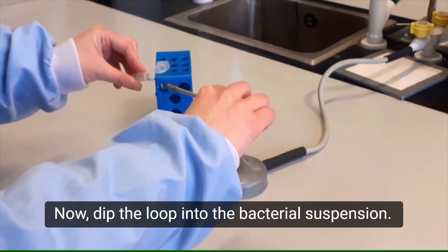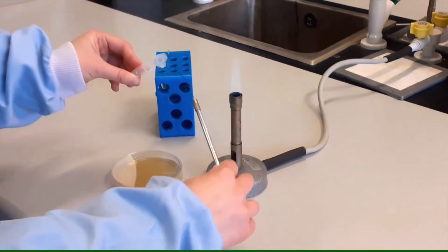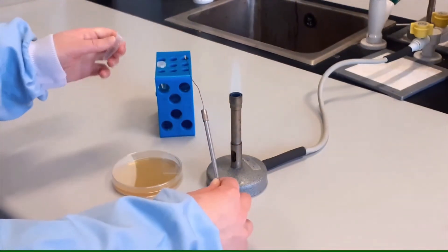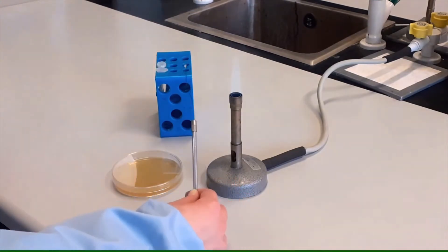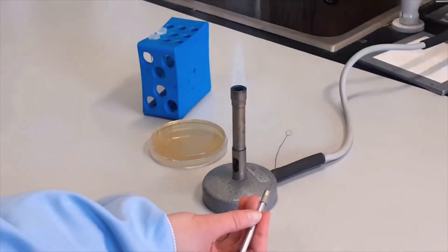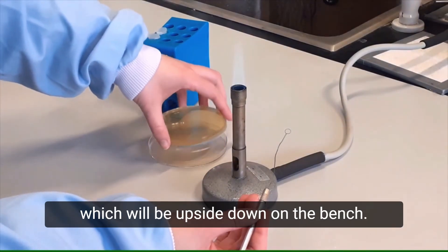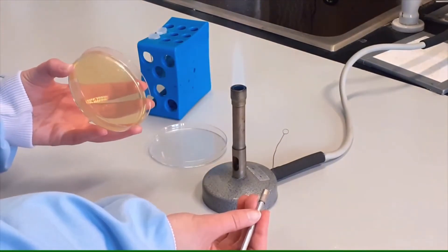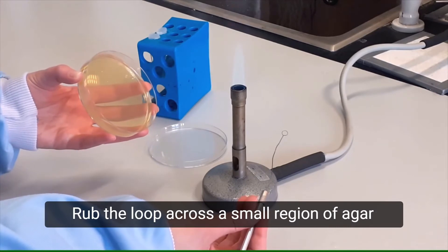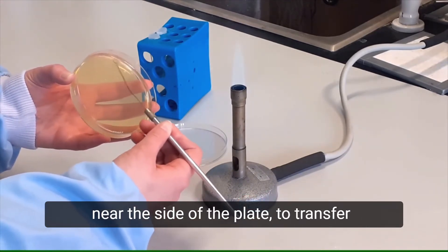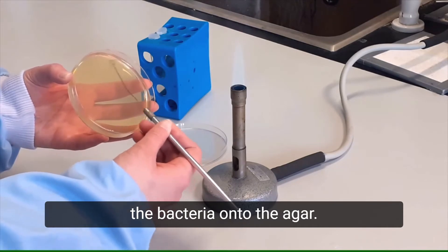Now dip the loop into the bacterial suspension. Close the Minifuge tube and put it down. With your free hand, pick up the agar plate, which will be upside down on the bench. Rub the loop across a small region of agar near the side of the plate to transfer the bacteria onto the agar.